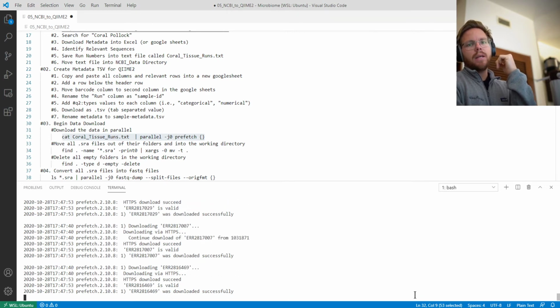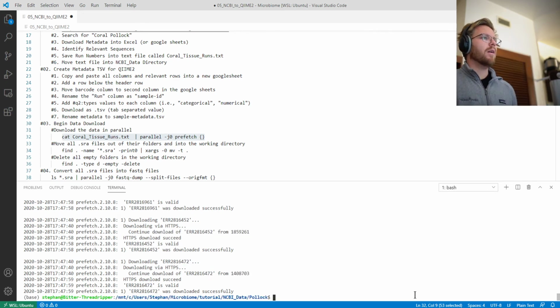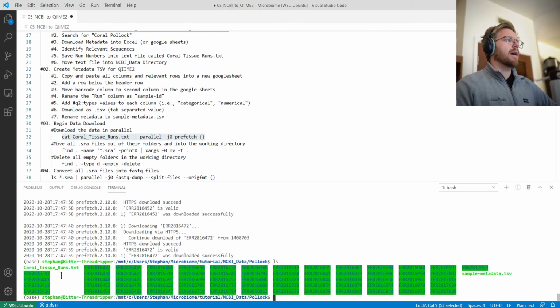And you'll see for metagenome files, they're usually not that large. They're on the order of 20 megabytes or so. So we've got all of our files. If we type in ls, we can see, here they are. They're all in their own directories. So that's what this green color means on my screen, that it's a directory.